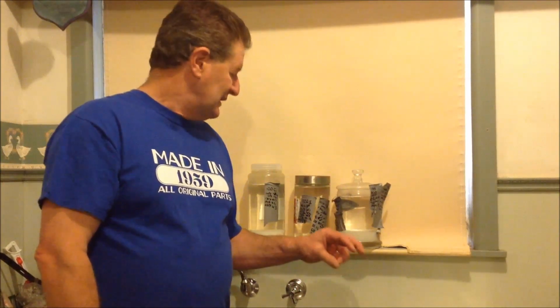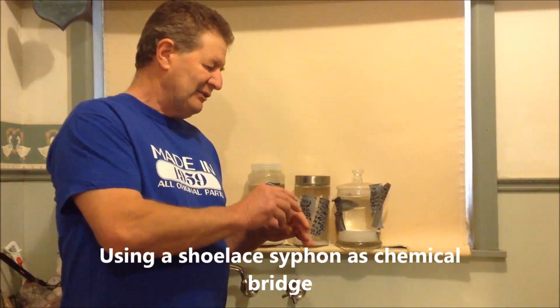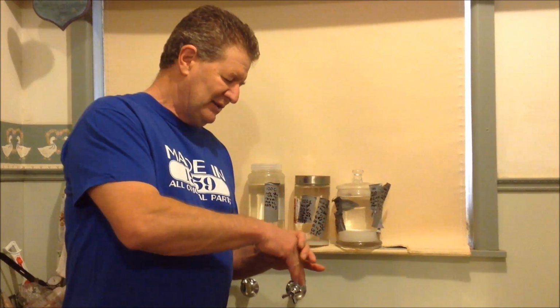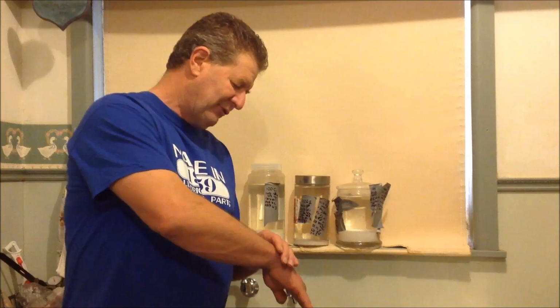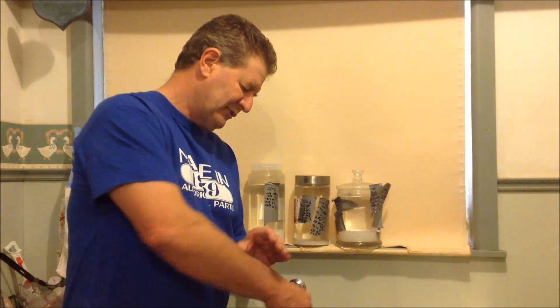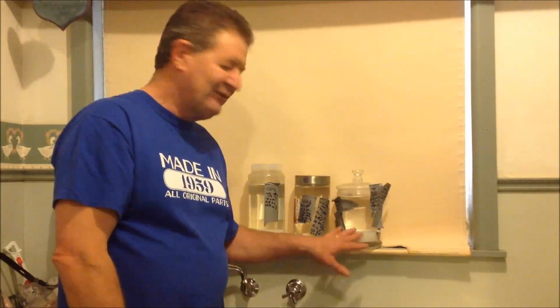In particular, it came into the solution very slowly, but it formed like a tubule, and what I imagine is happening is the sodium hydroxide is going down the centre. It's sort of like an ocean tube from a vent on the ocean floor, and this liquid's coming through the centre and building up on the edge, so you've got a flow of hydroxide down through the middle, and it grows a tubule, even, believe it or not, till it actually touched the bottom of the container. Quite interesting in itself to see that. So enjoy, guys.